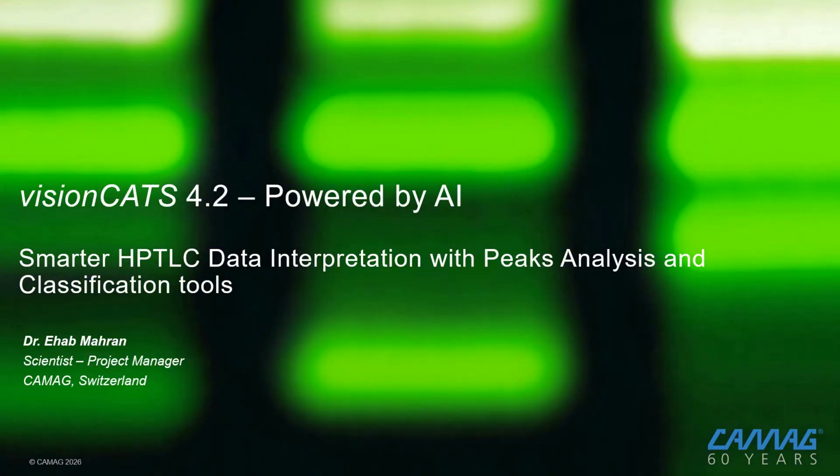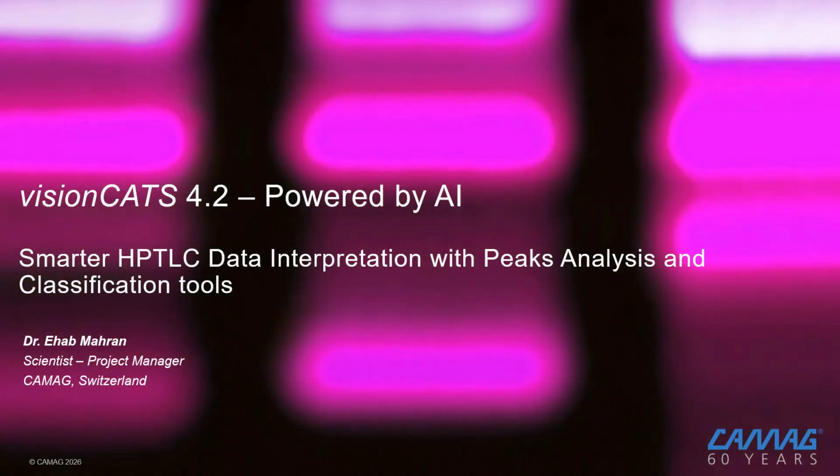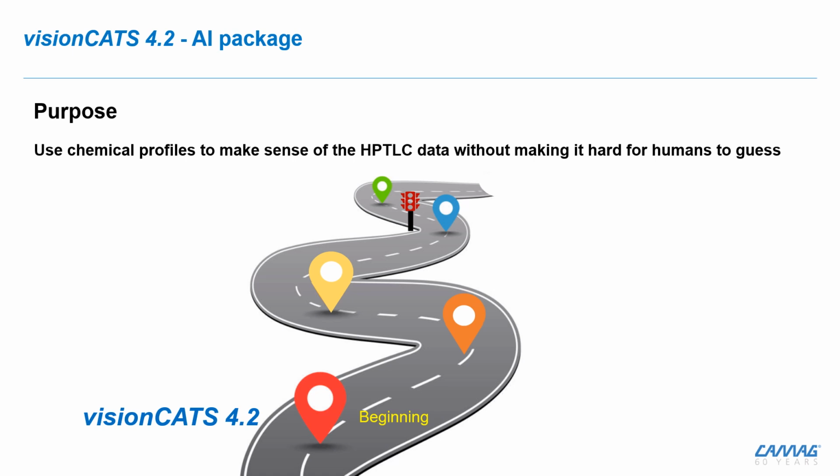We will gain some insights into how to configure the analysis parameters and how to use the new tools by demonstrating a couple of real examples. Let's start with knowing the purpose of these tools.